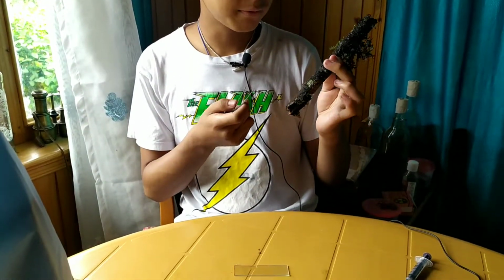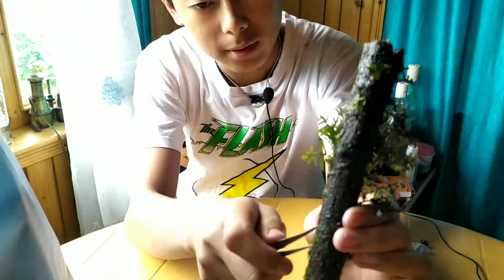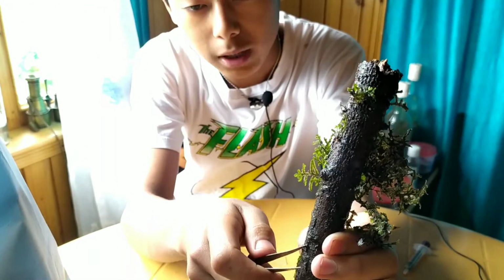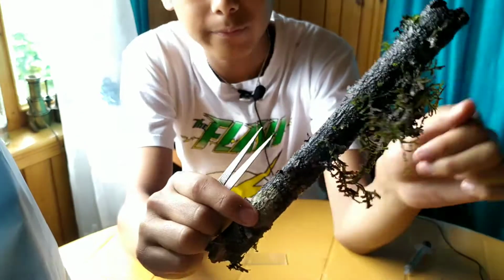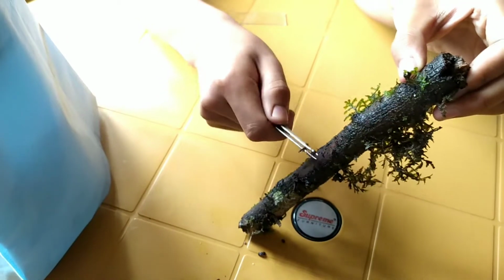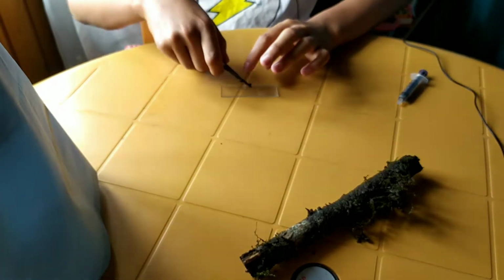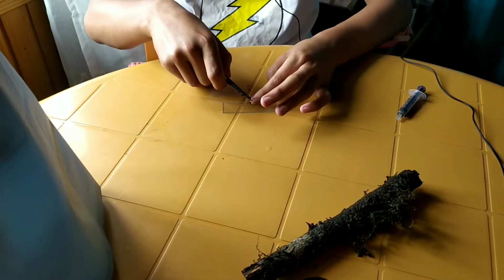So firstly, I'm going to take this wood and a microscope slide and forceps, and with the help of forceps, as you can see, the outer bark of this wood, I'm going to scratch it like this. I'm scratching it like this and going to place it on the microscope slide like this.